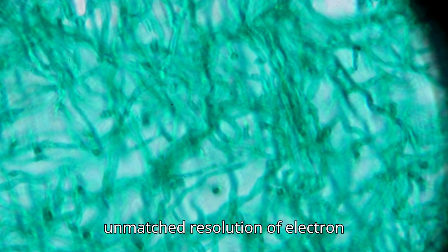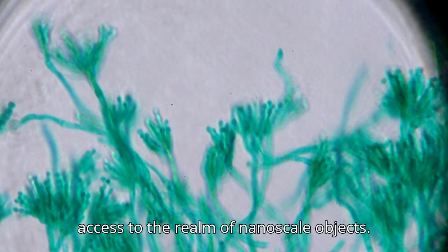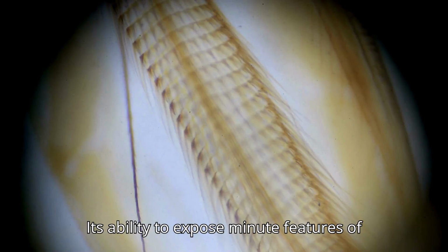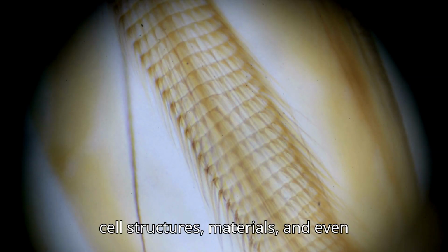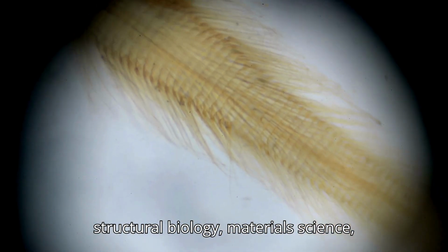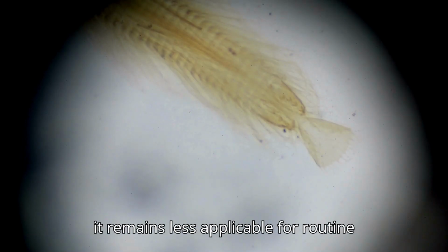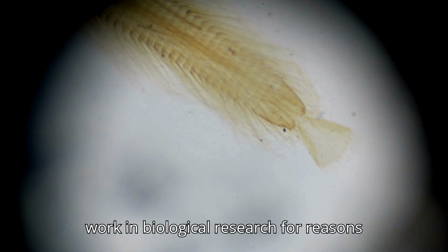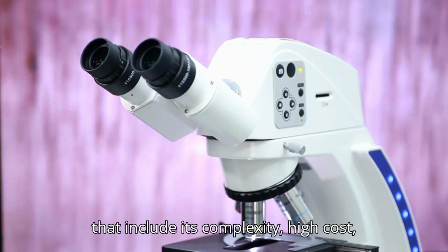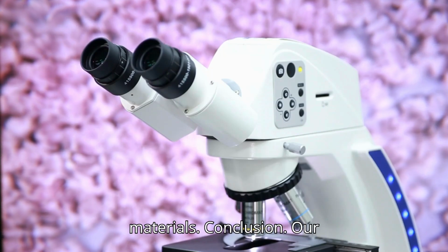However, the unmatched resolution of electron microscopy has provided researchers with access to the realm of nanoscale objects. Its ability to expose minute features of cell structures, materials, and even molecular arrangements makes it indispensable in nanotechnology and in quite a number of fields, such as structural biology and materials science. However, it remains less applicable for routine work in biological research, for reasons that include its complexity, high cost, and the necessity to use processed or dead materials.